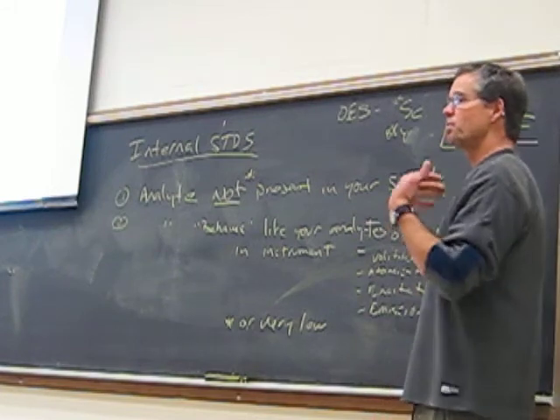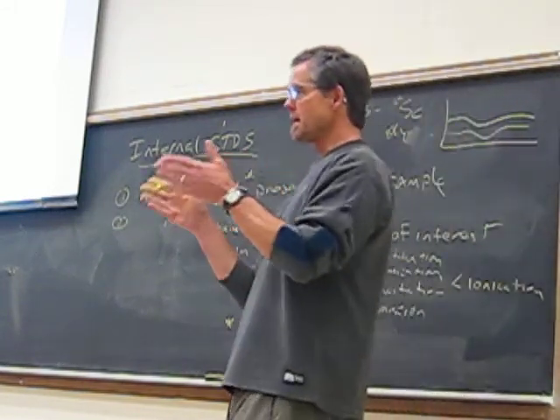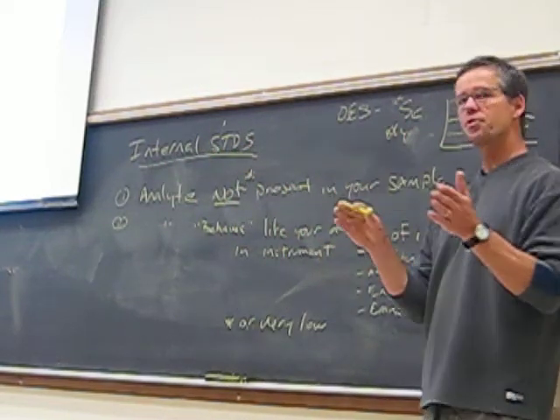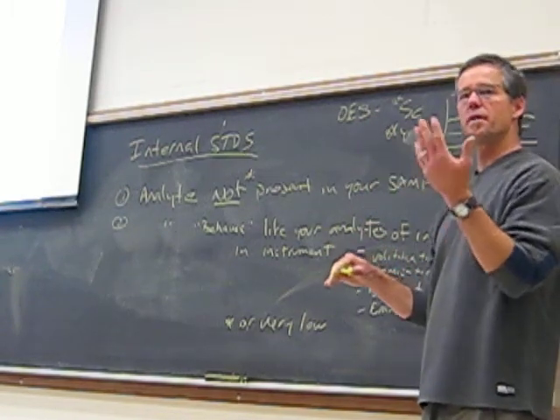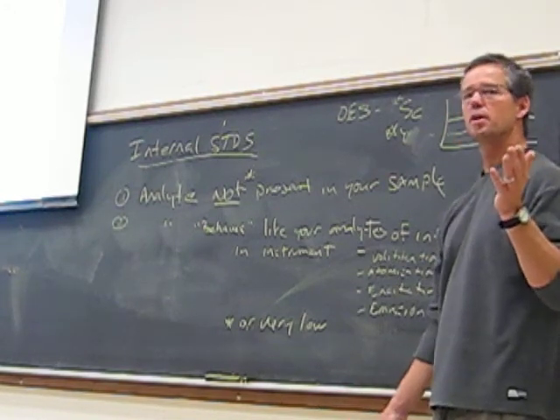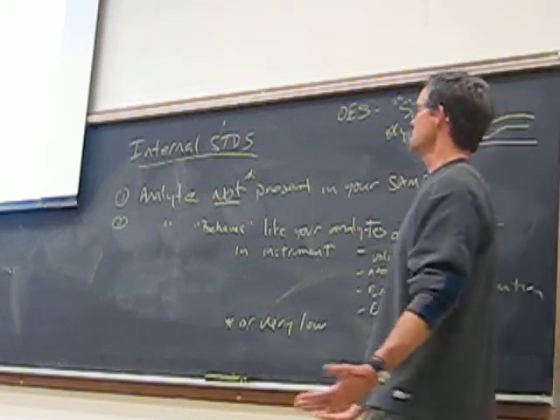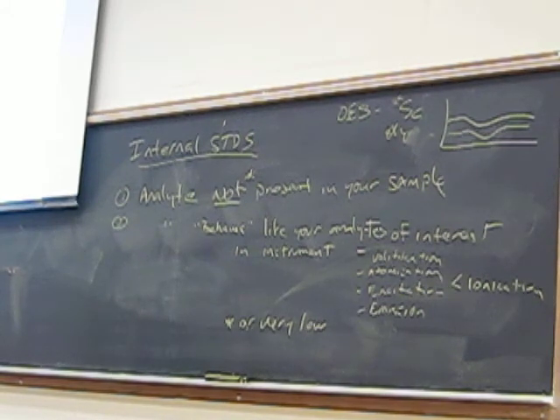All right, so you guys have worked so hard, do all this work in the lab, and it's high labor, low reward for what you've done so far. And you'll see when you start doing things in methods like OES, you'll go in with 20 samples, and you'll sit there, and the instrument does everything for you. And in an hour, you'll get data for 50 elements. And you'd be like, oh, this is awesome. This is so much faster and more efficient than what I've been used to. And people have worked hard to develop technologies around this.